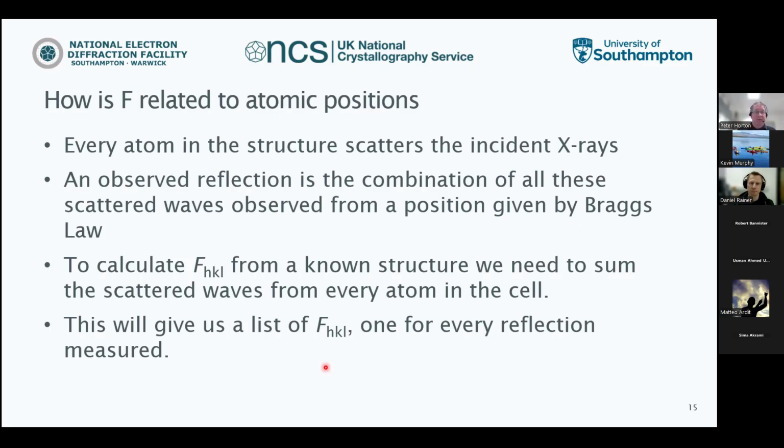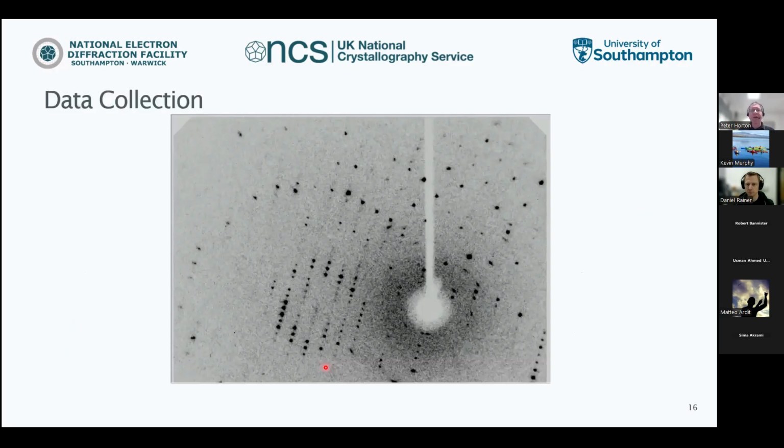The result of all that, which is probably easier, since that's most of the maths done, is what we see on the screen. Here is a single diffraction image. We see lots of spots. You can see there is some sort of grid. They look nicely aligned, the same distance apart this way, and a similar distance apart the other way. That is because we're seeing an inverse of the unit cell here. So we have direct information to see that actually the crystal's working quite well.